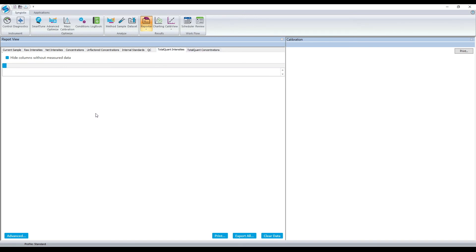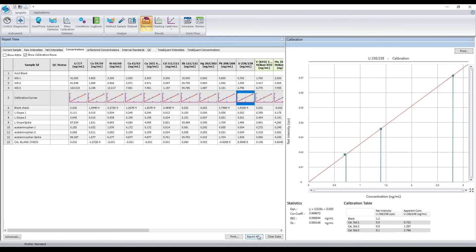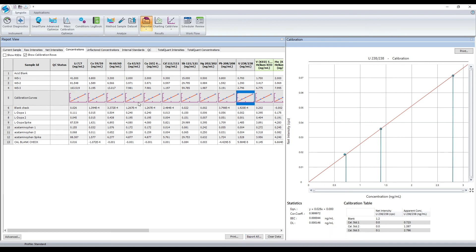For ease of exporting and further data review, there is a one-click Export All button that will export everything you see in the reporter to an Excel file.